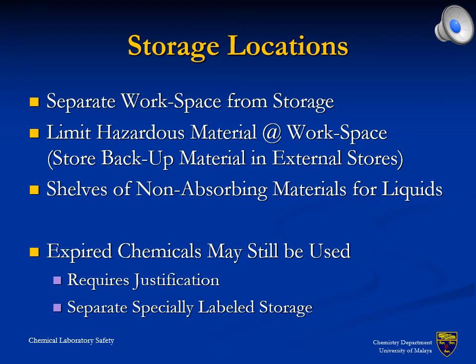Chemical storage must be separated from the location where chemicals are used. Suitable storage places involve refrigerators, ventilated cabinets for flammable liquids and specialized cabinets for corrosives. Most importantly, however, chemicals, particularly liquids, shall not be stored on shelves that enable absorption, for example wood. Moreover, secondary containment shall be practiced for larger containers to prevent damage and harm due to broken chemical containers.